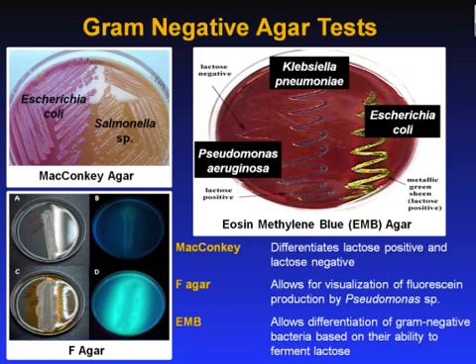The bottom left photo shows F-agar, sometimes called flo agar. It is used to stimulate production of the pigment fluorescein. This allows for specific detection of Pseudomonas species. Note the intense fluorescence of the pigment fluorescein under UV light.